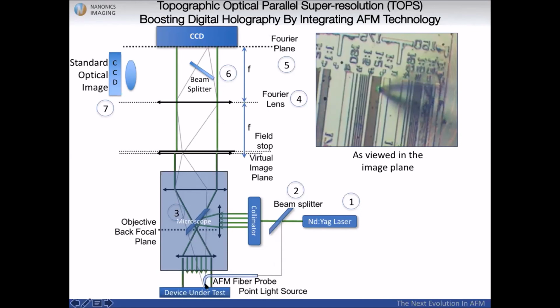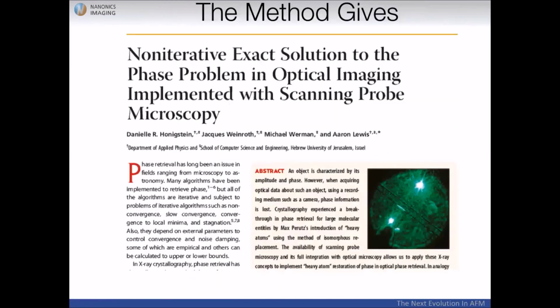The beauty of this illumination is that in the Fourier plane, it's a uniform distribution of light. That means what I was telling you, that the light coming from the sample intersects in the Fourier plane, okay, and not all of them intersect. In this case, all of them intersect with that point. And this is very important because as a result, you can get an exact solution of the 3D structure. Not without problems, like everything, but you can get an exact solution.